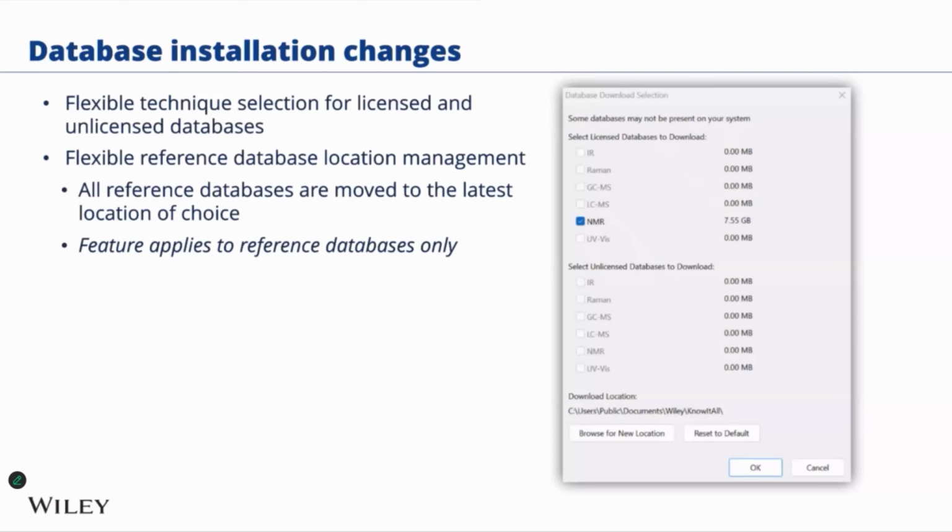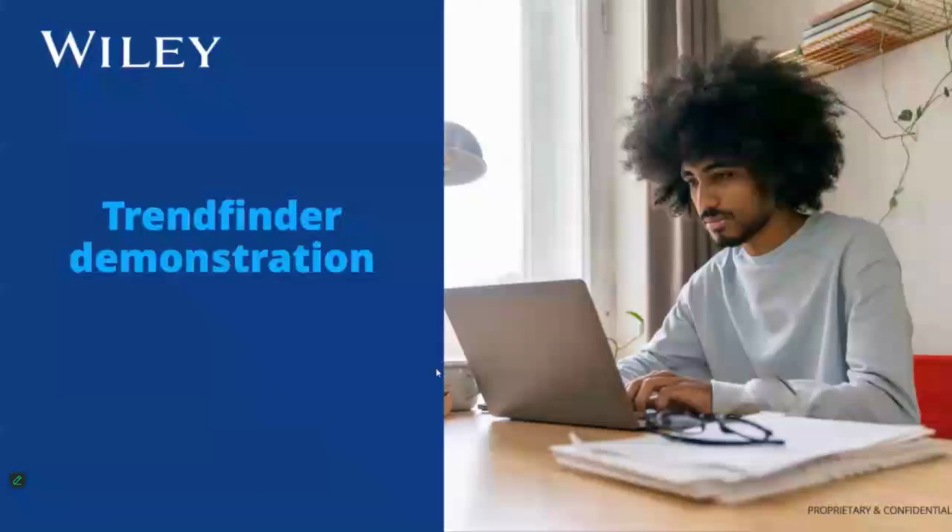For database installation of reference databases, you can have a choice to install or move it to a different location rather than the default location. The default location is on the C drive. You may want to move to the D drive. When you install a database, you can manage the move, as you can see, browse to a new location. So this is a neat feature when you have limited disk space. Okay, now those are the major changes in KnowItAll. Now we are ready to perform a demonstration of our new application Trendfinder.